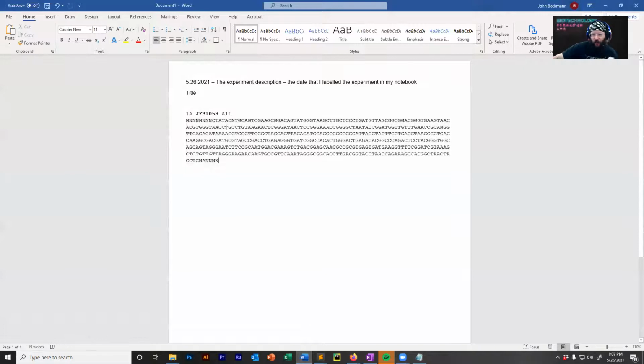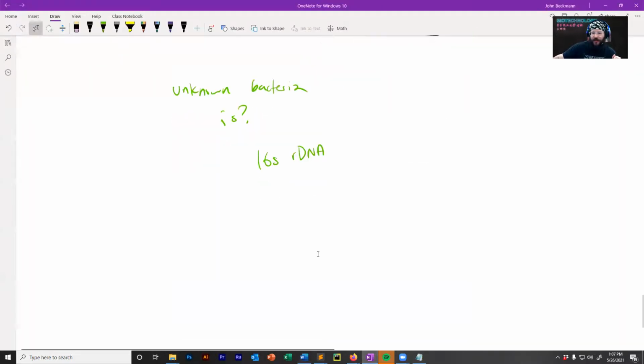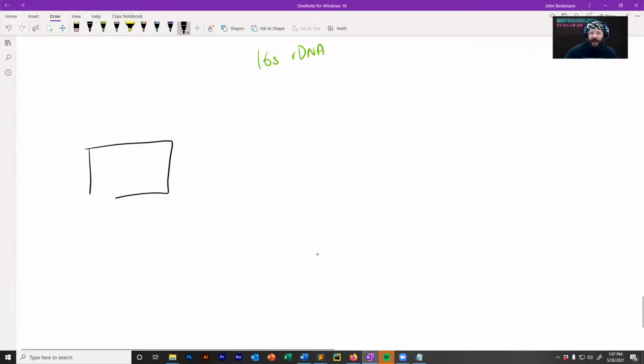And typically now, once the BLAST finishes, what we're going to look to do is highlight and color code certain features of this in my Word document. And just as a quick refresher, this is now your data, your important data. And I can't be responsible for all my students' data. They need to be responsible for their data.